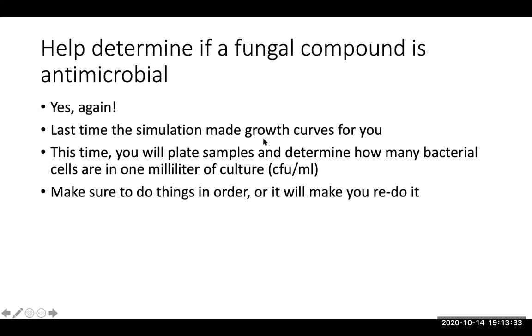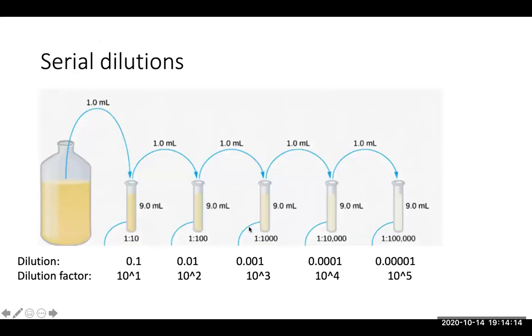And if you were to take enough samples over enough time, you would actually be able to make that growth curve yourself, based on the data from these plates. And it was a little unfortunate that at the end, you have 24, 48, 72, and 96. So you had 4 days of data that you counted plates and found the calculations for the concentrations, and then they didn't plot it into the growth curve. So that was kind of a bummer, but you could make it into a growth curve. So anyways, let's go ahead and look at how to do this.